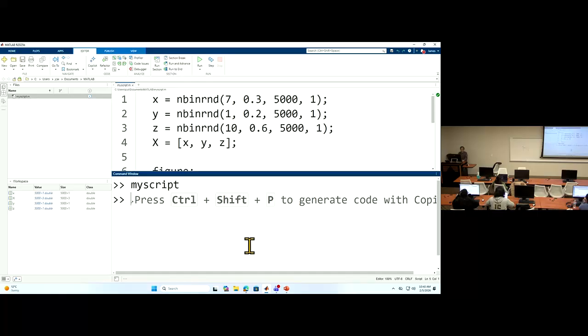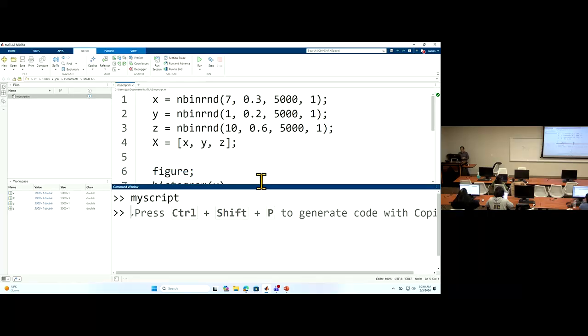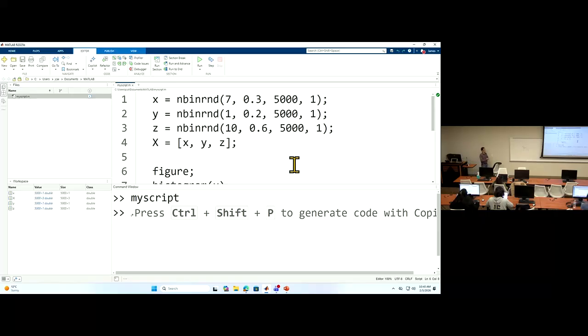Any questions? No problem? You can make it? Okay. Now we will move one step further. So this script is just one time. It's static. There are no parameter changes because we cannot change those parameters. You have to open it, change it manually, and save and run. But we want to make it into a function, so every time we can call that function and generate those differently.